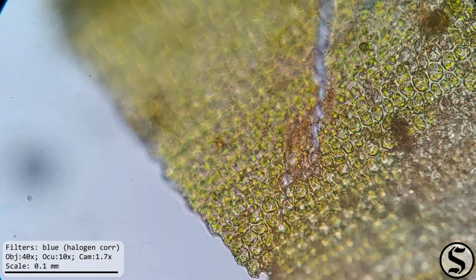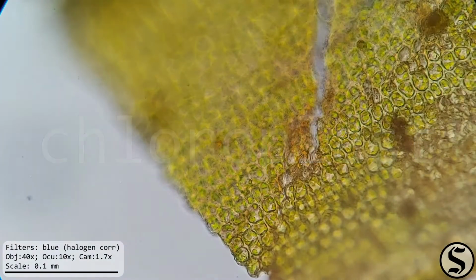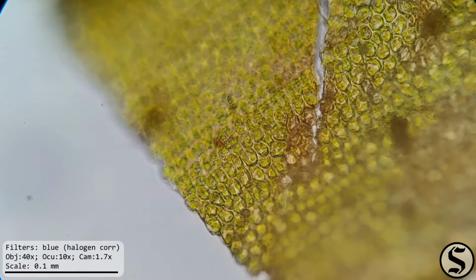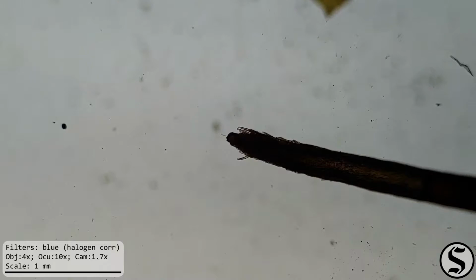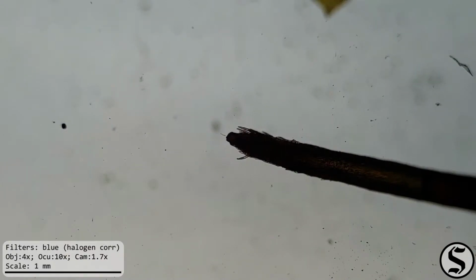And under high magnification, we can really see the chloroplasts. That comes from the Greek chloros, green, and plastos, formed. And they're the little green parts within the cells that are responsible for photosynthesis. Zooming back out and going over to the sporangium, that's spora for seed, and angion, capsule, Greek again.